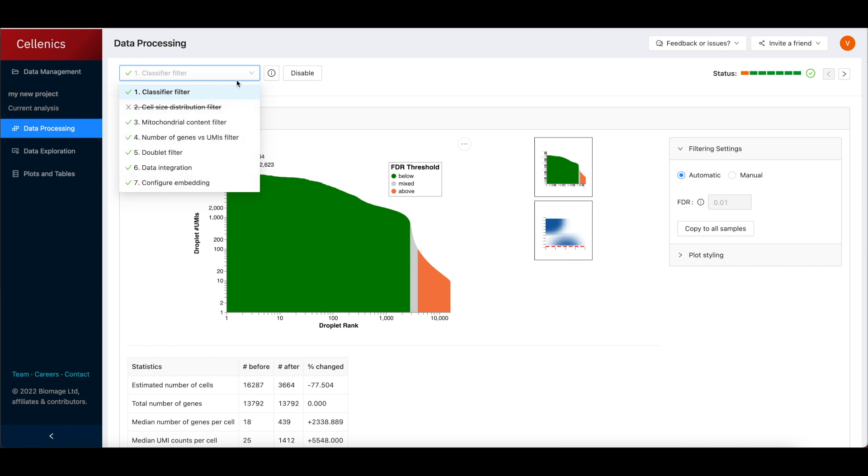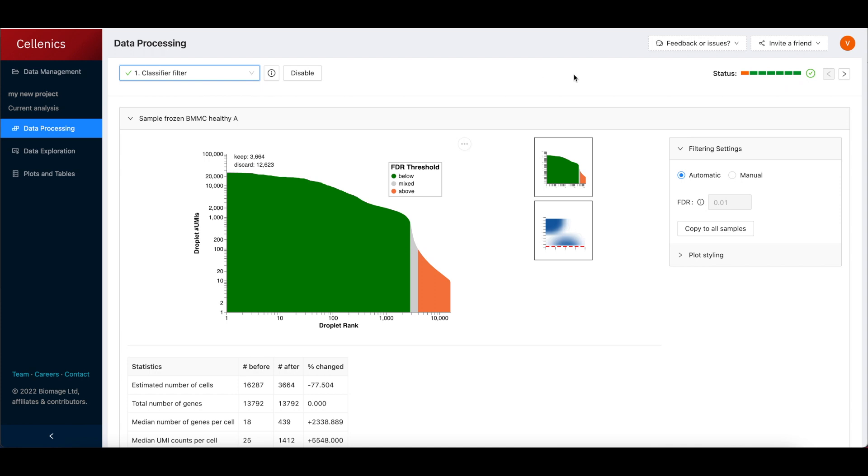Importantly, this pipeline runs automatically using default settings that are standard for a given step or are derived from the distribution of your sample data.